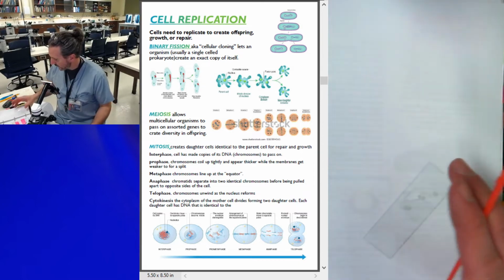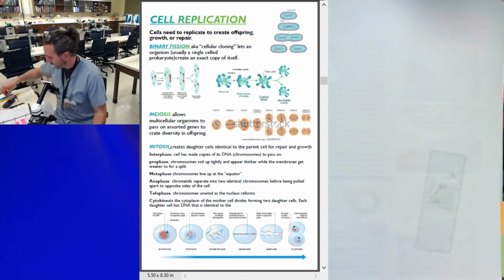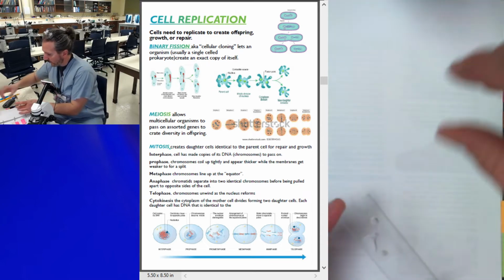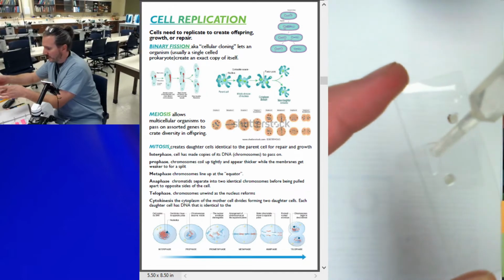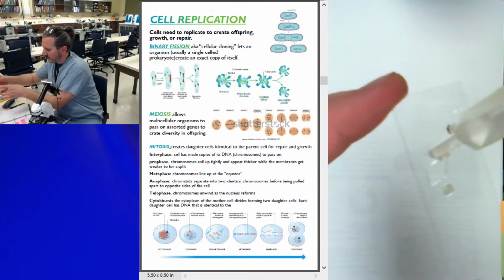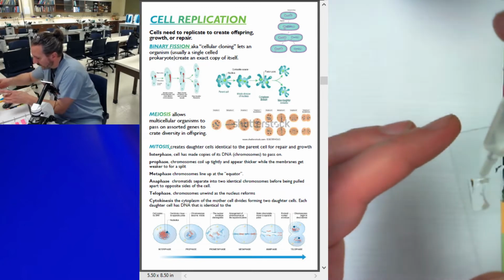Okay. So now I have just a couple small pieces. And I'm going to take a peek at this. I'm going to put a little bit more water in there. So I see a bubble right along here. I don't know if you can see the bubble. Water right here on the edge. Oh, still a little bit of bubble.